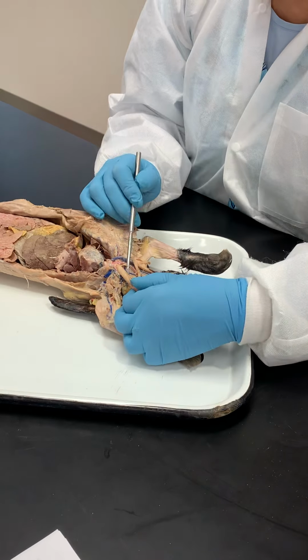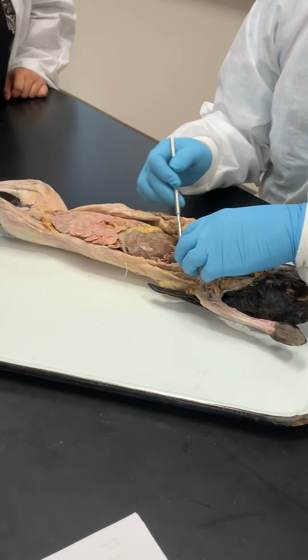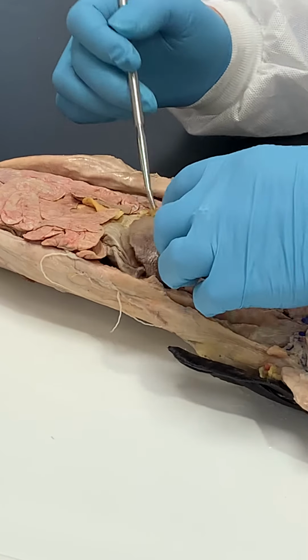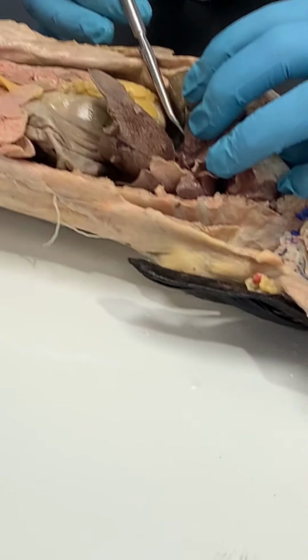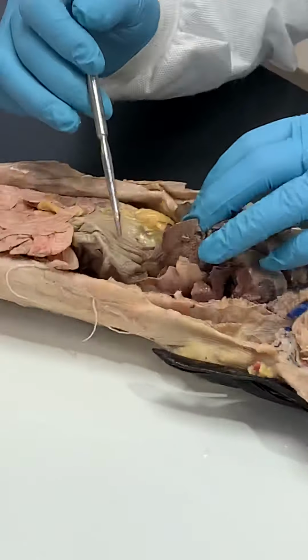Esophagus, we already showed you. It's going to be behind the trachea here. And then we go down to the stomach. And this is the big old liver. You can see the liver's lobed as well. Here's the gallbladder. You see the green down in here? Right, there's your green sac. That's your gallbladder. And then if you lift this up, you get a big old stomach.